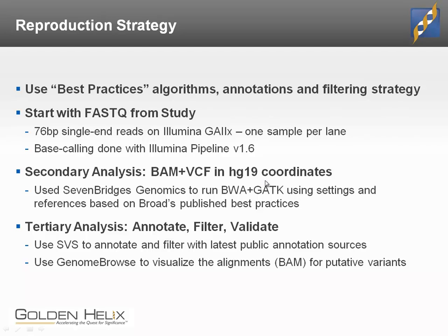It's also good to note that because it's 2012, we want to do everything with the modern reference sequence. It's not that I would expect the reference sequence to change dramatically between HG18, which was used in the original study, and HG19. For a gene that is highly conserved, like we would expect it to be, those genes should be extremely stable from one version to the next. What matters more is now we can use all of the annotations that are based in the modern reference sequence coordinates.